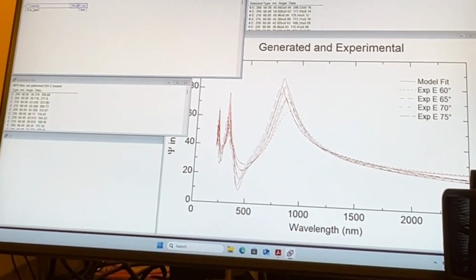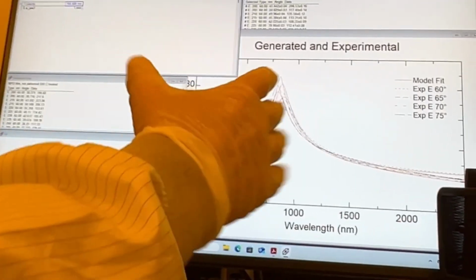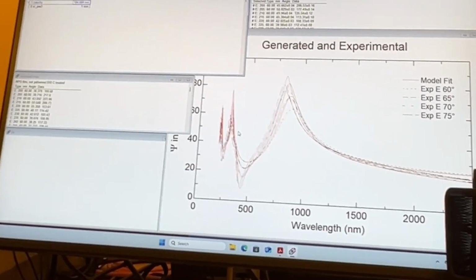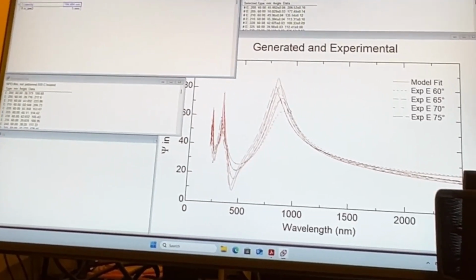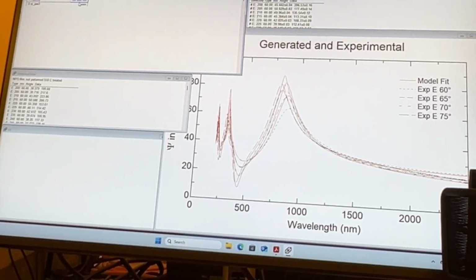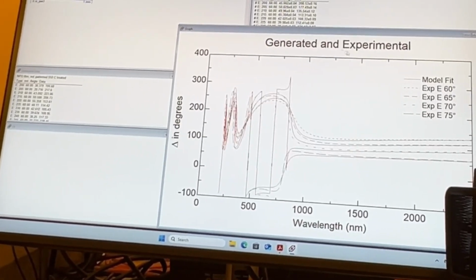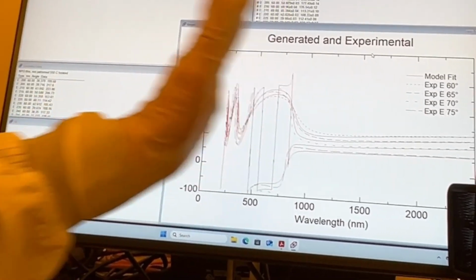Okay, and this also assumes that we are transparent, i.e., K is equal to 0 right now. Currently the Cauchy is, you could add stuff to make some absorption in there, but that's essentially what we have. So the thickness with that assumption is around maybe 180.